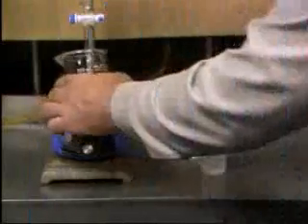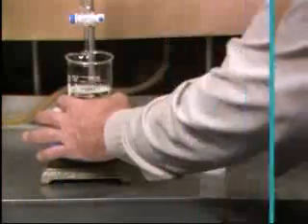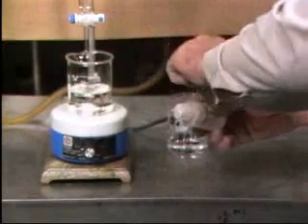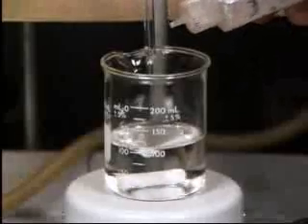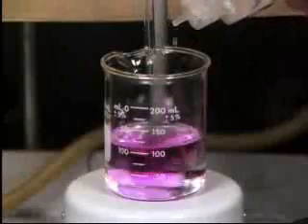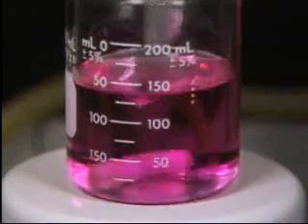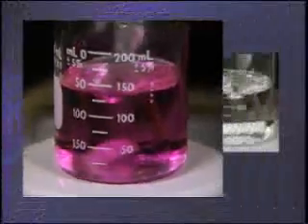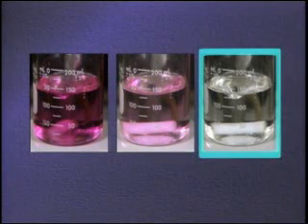Then the beaker containing the sample is placed on the mixer and the mixer is started. Next, the indicating solution or indicator is added to the sample. For this test, 3 drops of phenolphthalein are used. Methyl orange and methyl red are other examples of indicators. The purpose of an indicator is to change the color of a liquid to give a visual sign that a chemical reaction is complete. When the reaction is complete, the color produced by the indicator completely disappears.